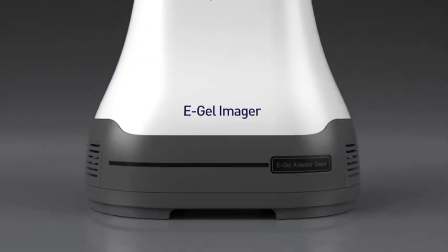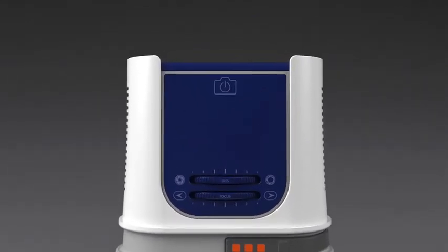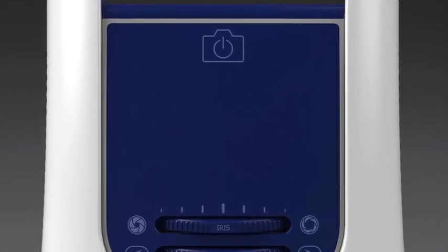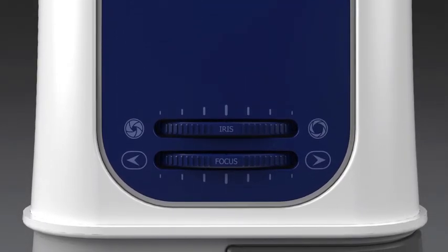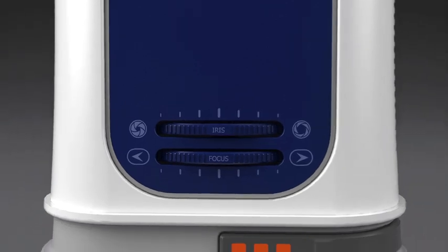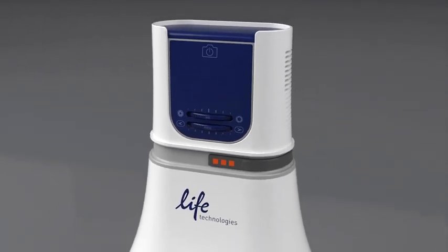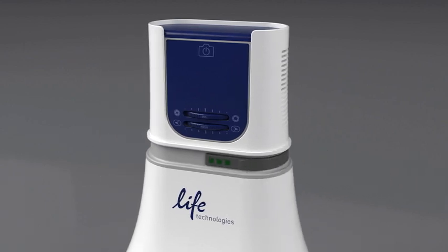The eGel Imager camera hood houses a high-resolution, scientific-grade digital camera that drives the exceptional performance of the eGel Imager system. Most of the controls for image acquisition are within the gel documentation software. However, there are two physical dials on the front of the camera hood that can be used to control the iris and focus of the unit. Interchangeable filters allow even greater flexibility to capture images of various gel stains. The orange-hued, universal filter is a good choice for most applications, but it can be replaced with a green filter that is optimal for visualizing cyber stains when using UV transillumination.